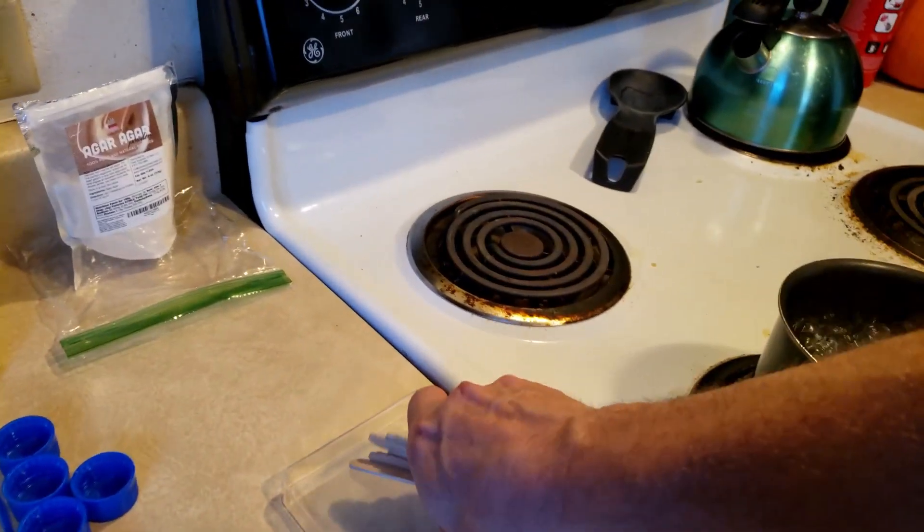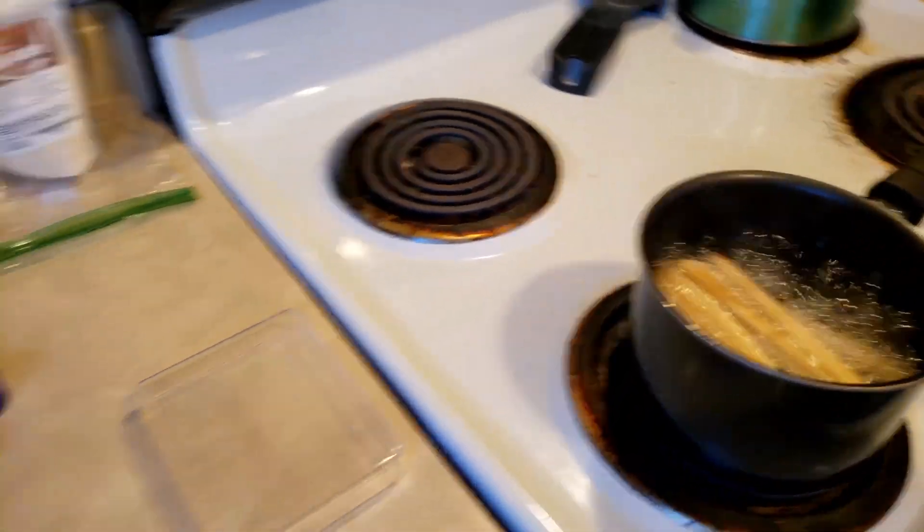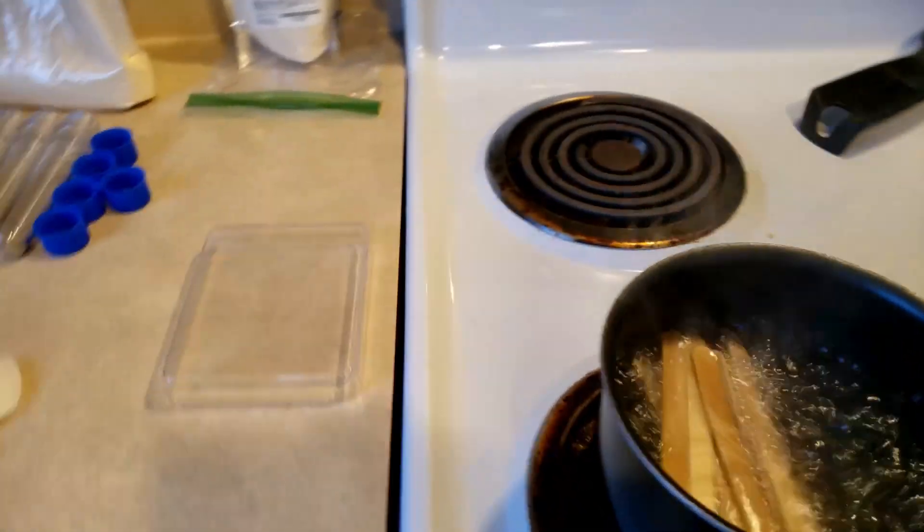First thing we're going to do is take some sticks, put them in there with some boiling water and let them boil for about 15 minutes.